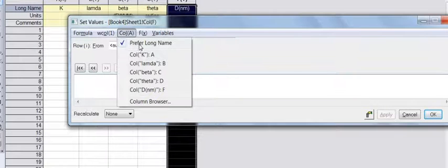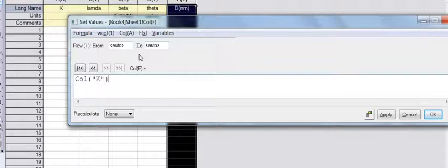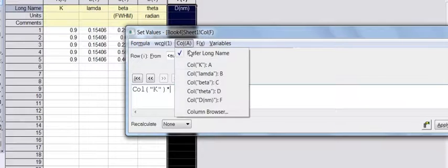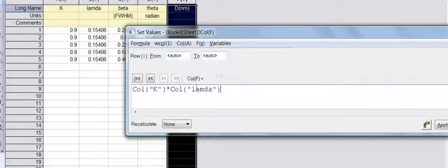So we will take the column, multiplication with the wavelength. I am putting it in a common bracket, and then according to the formula it should be divided by the beta, which is the FWHM, with the cos theta.